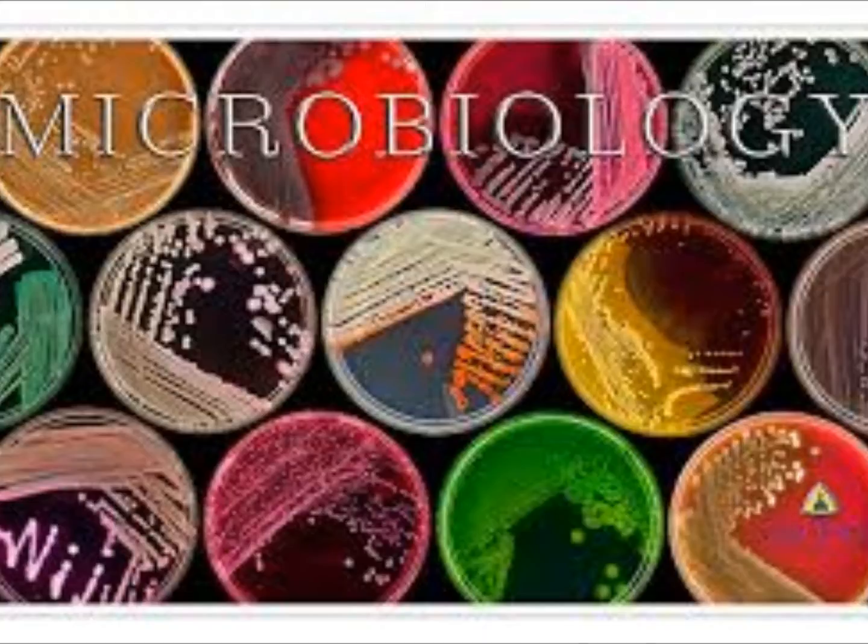We're going to start with the Gram stain first and let it dry. Before we start looking at our plates, let's go ahead and do the Gram stain, because with the Gram stain we emulsify the organism in saline or water, and it takes a while for that to dry. So we'll do that first, so it can dry while we're evaluating the plates.